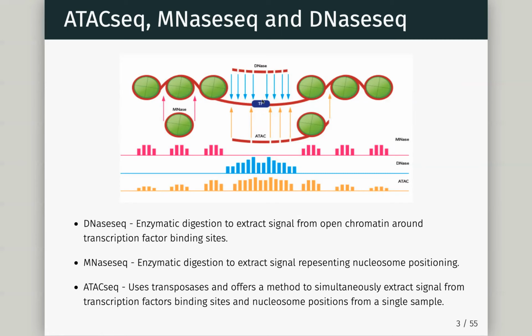So then the question is, why do they limit it all the way down to 100 rather than 100 to 147, just to be sure? They don't want any of this overlap because they really wanted to be sure that we can consider it open chromatin. Was that the question? Is why isn't it 147 and below?